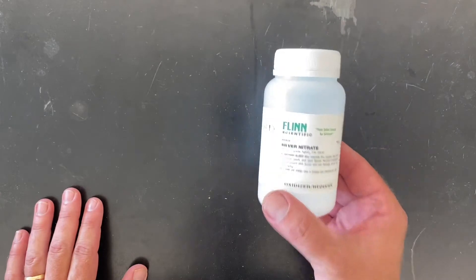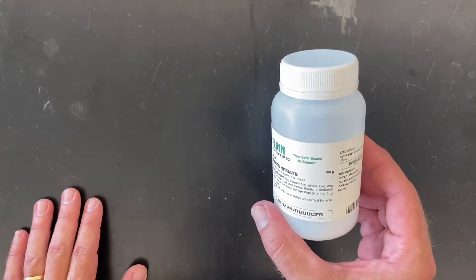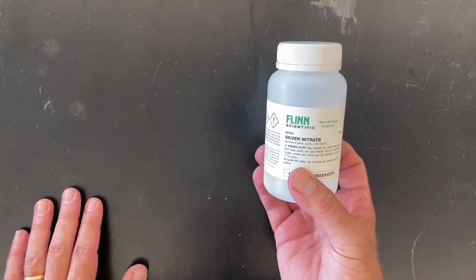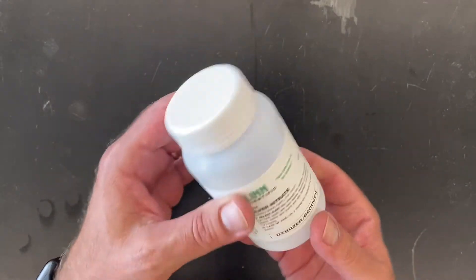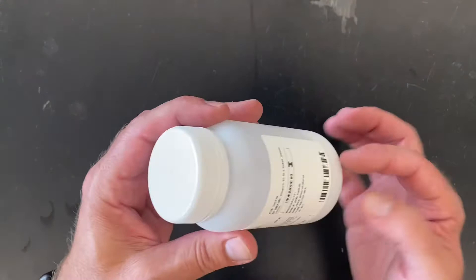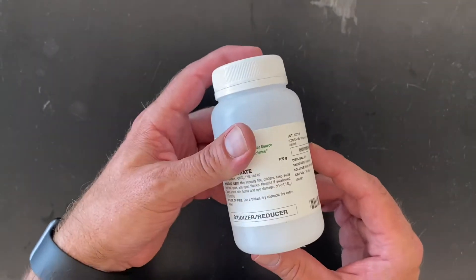Another one that is surprisingly heavy is this one — silver nitrate. This is only 100 grams but again it's surprisingly heavy. There's actually not a lot of stuff in here; it's really mostly down at the bottom. They gave a pretty big bottle for it but most of the bottle is empty.